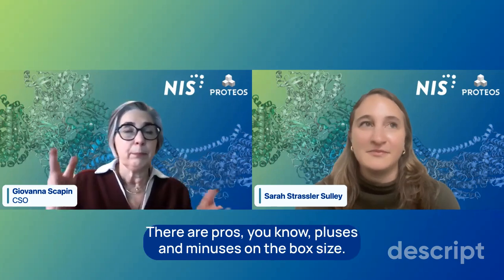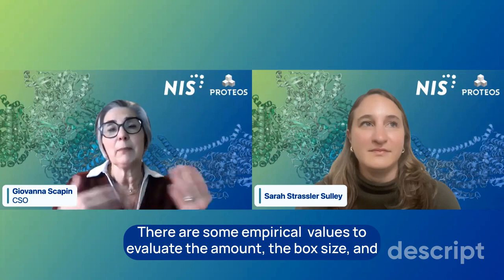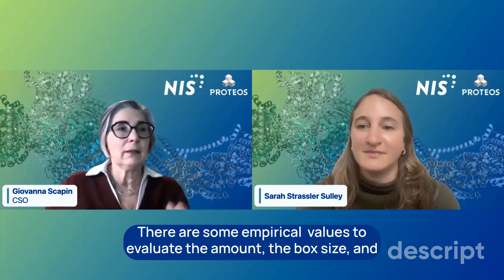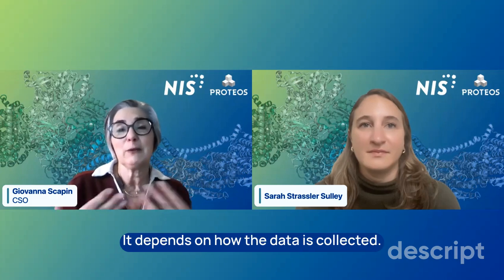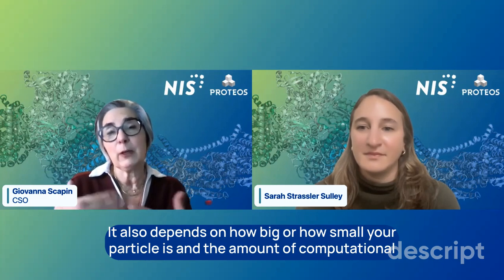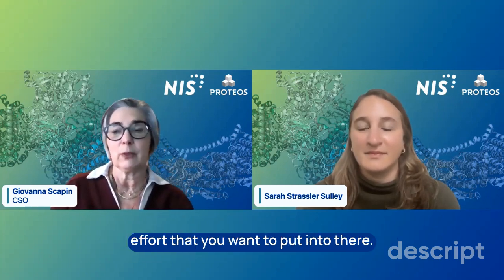There are pluses and minuses on the box size. There are some empirical values to evaluate the box size, and it used to be 1.5 times the size of the particle in the biggest dimension. I'm sure they change. It depends on how the data is collected. It also depends on how big or how small your particle is and the amount of computational effort that you want to put into it.